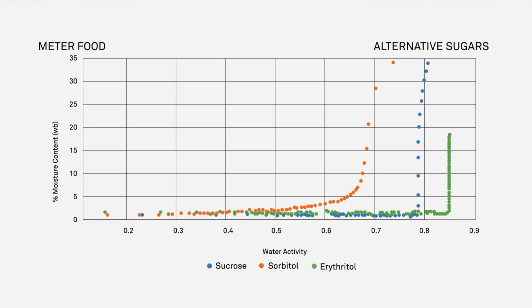So when I was talking before about that crystallization problem that we were finding with erythritol, that's what we would see at 25C. We had to really crank up that heat to get it to go into solution. And as I read some things online, that is a definite problem. So as we look at this isotherm, we would be able to see that right away, that it's not going to take up much moisture until it gets high enough, and it'll finally dissolve at 25C.